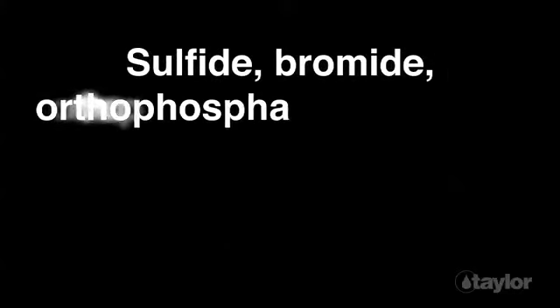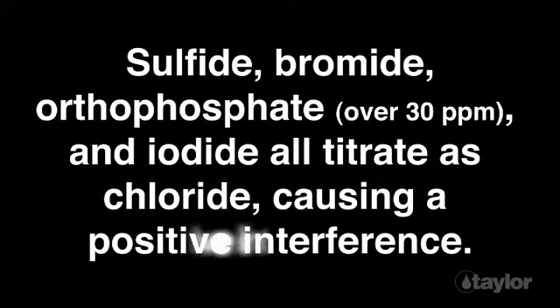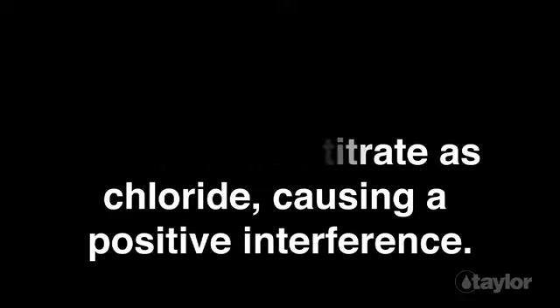Sulfide, bromide, orthophosphate over 30 parts per million, and iodide all titrate as chloride, causing a positive interference. To prevent this from occurring, test for the suspected interfering agent, dilute the sample with DI water as necessary, and then retest.